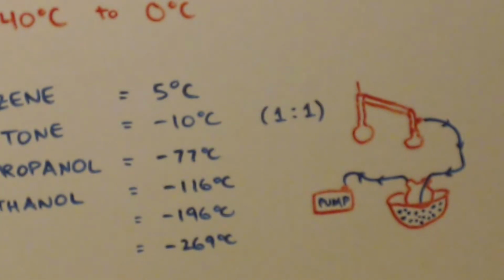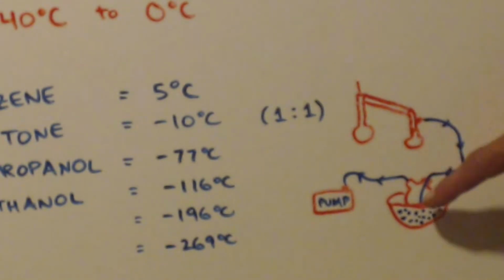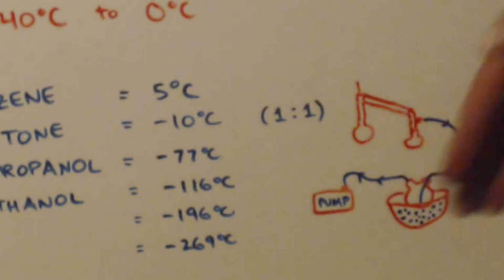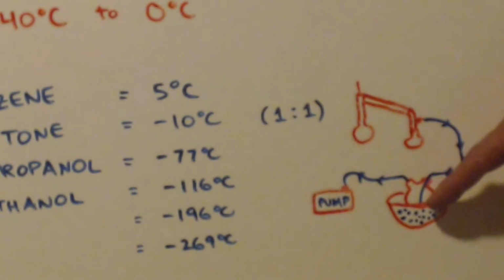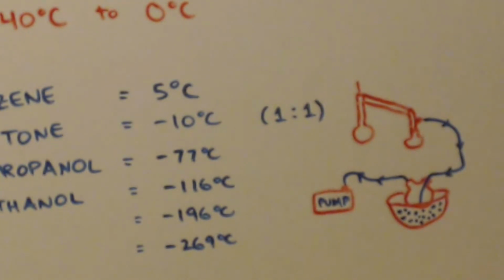But you could also, see how the hose comes in, and you put the hose all the way down at the bottom of the flask. The flask is in some ice water, and so the gas is forced to come out and hit the flask that you have cooled down a lot. And that way you won't get any water going to the pump.